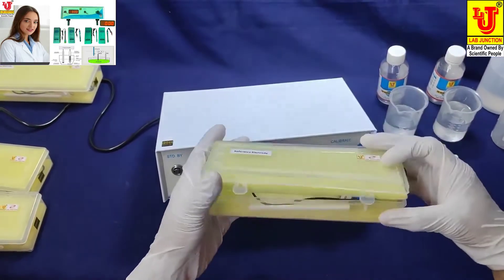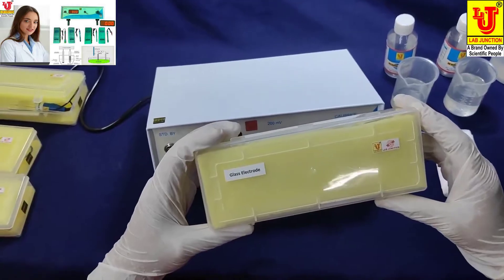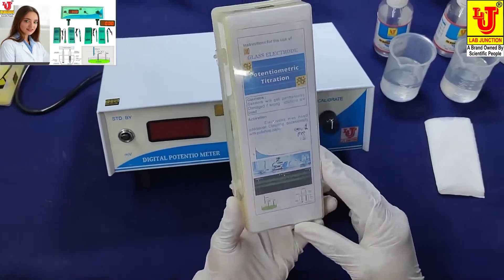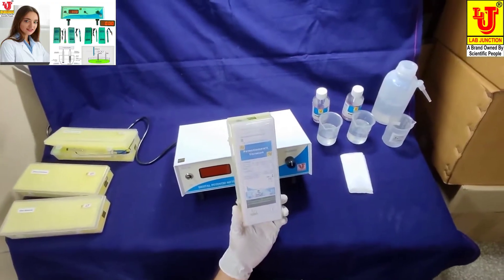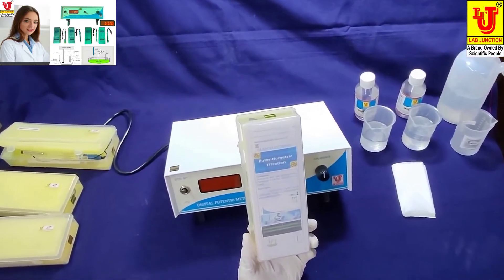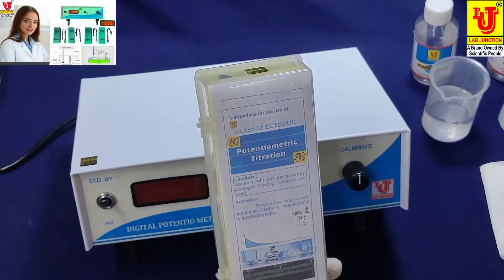The second accessory is the glass electrode. The reference electrode and glass electrode have main roles in the digital potentiometer. These two electrodes are mostly used for potentiometric titrations in many applications.